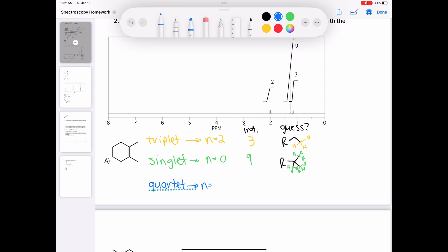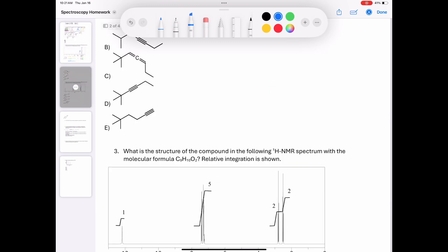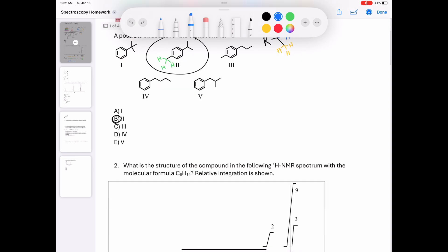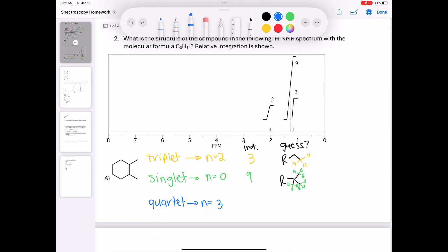Moving on to the quartet: the N value equals three and it integrates to two. We previously guessed there's an ethyl group based on the yellow protons, and this further solidifies that — because there are two protons in this environment with three neighbors, which are the three yellow protons. So it seems pretty likely that this is, in fact, an ethyl group.